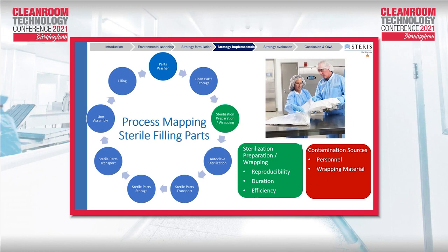So really here, what you are looking for in the wrapping of the material is reproducibility from the operators, adequate duration and efficiency in performing that. And of course, the source of contamination may come from your personnel and operators, or also from the wrapping material if it is shedding particles, for example cellulose fibers.